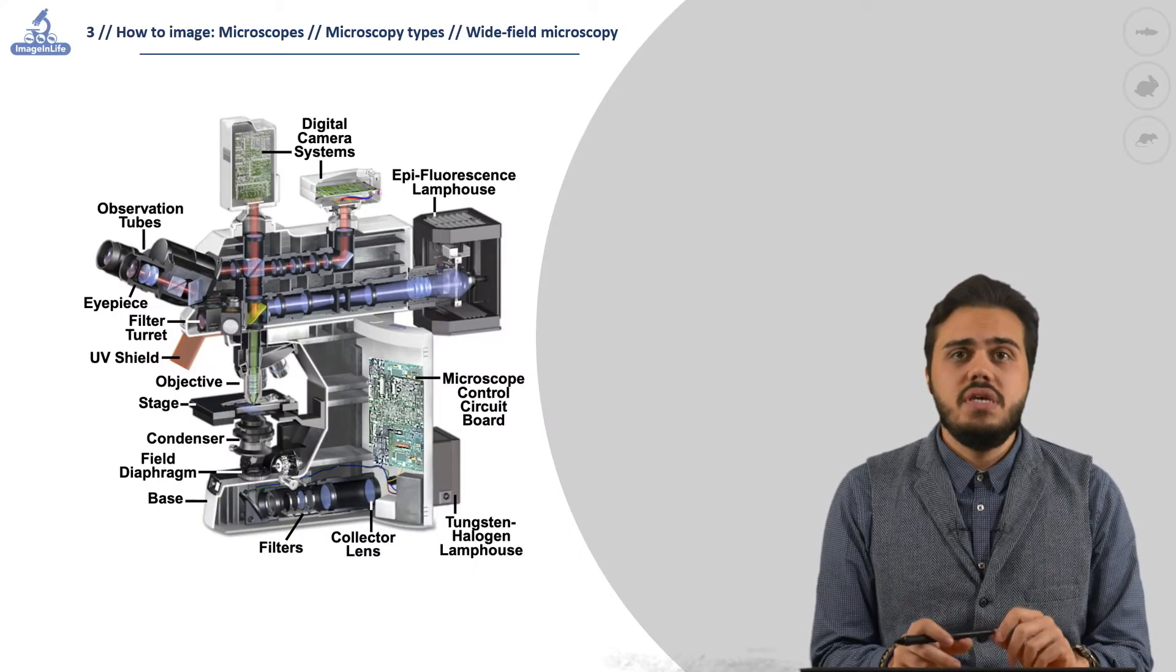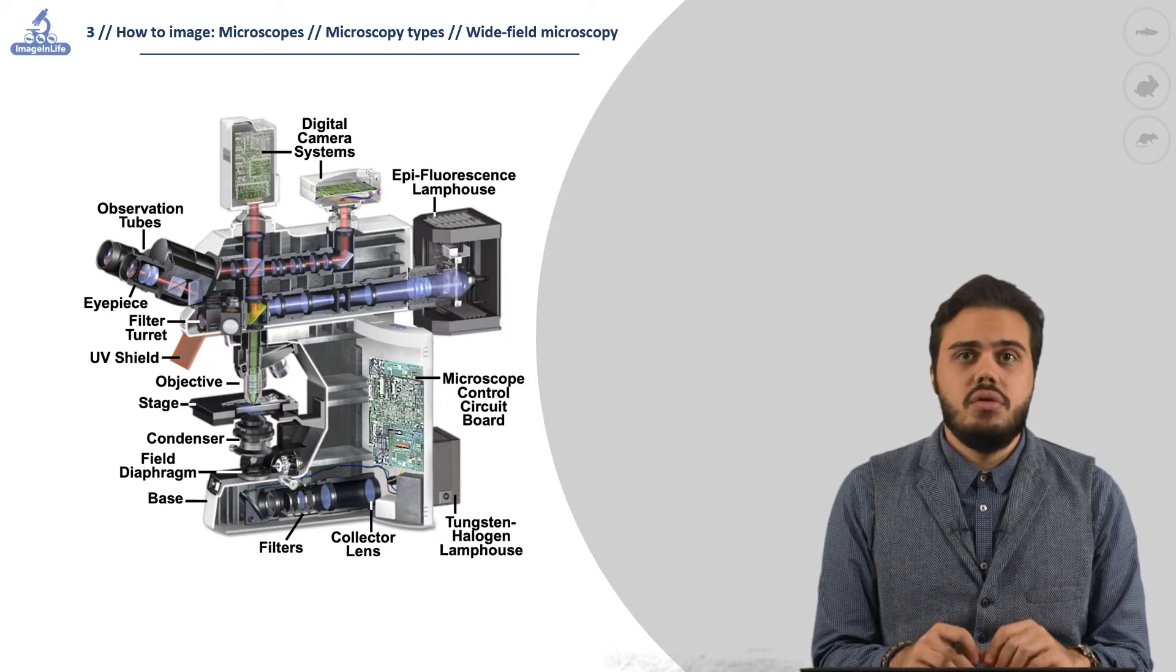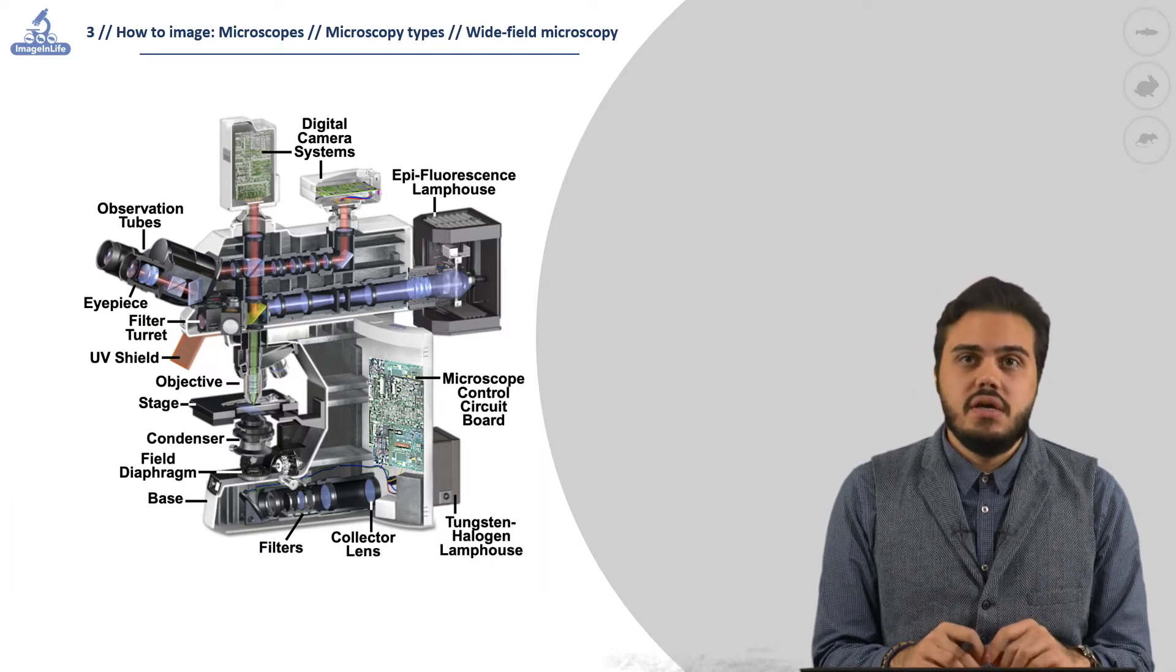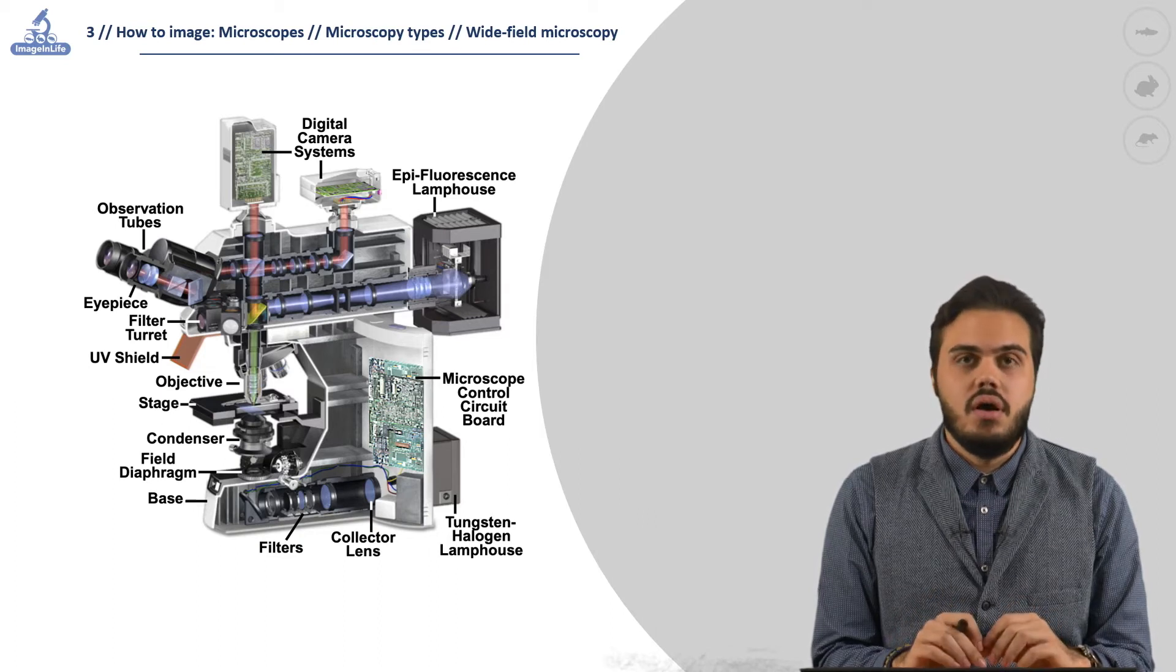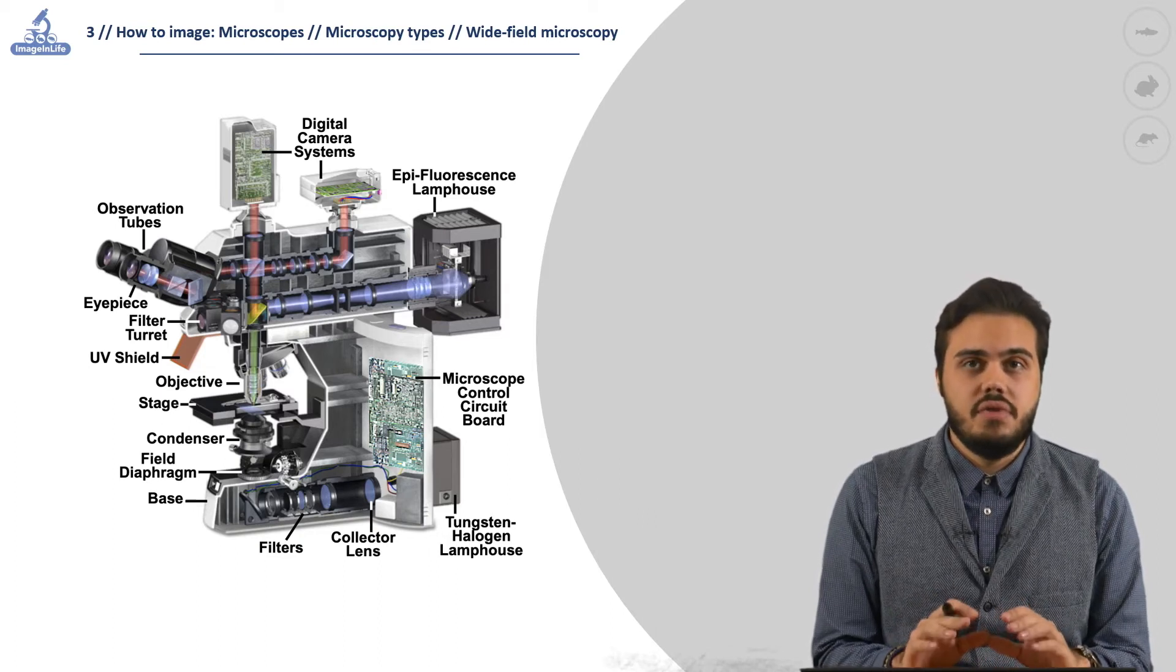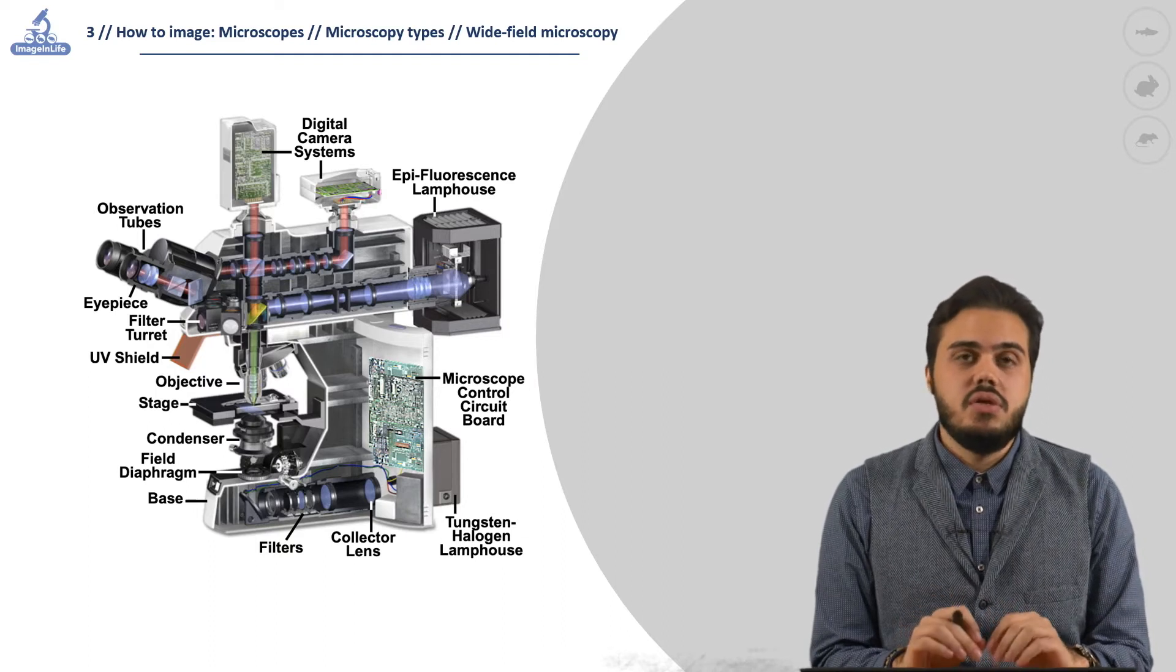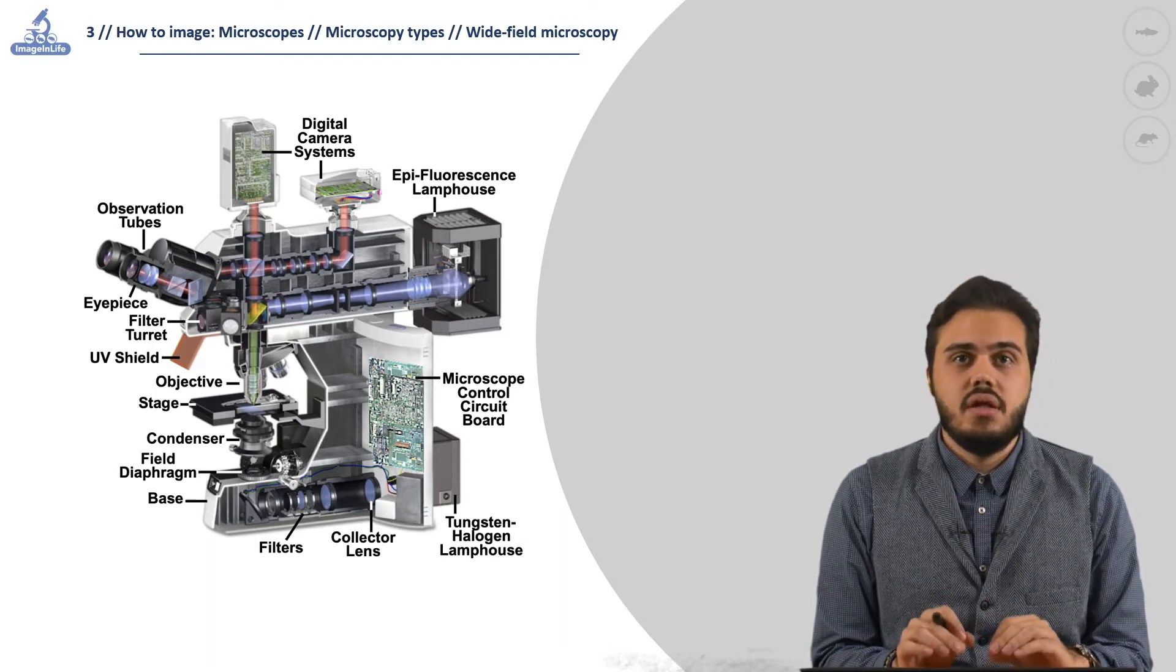Wide-field microscopy is the more basic and older type of microscopy, yet is still widely used. The most common type of wide-field is the bright field, where the specimen is illuminated completely by a standard illumination field.